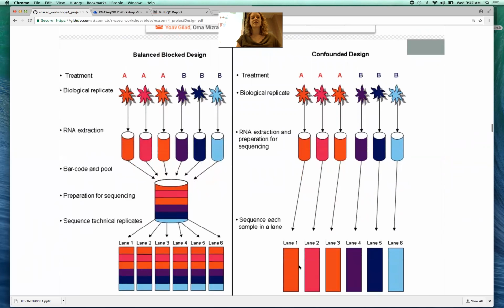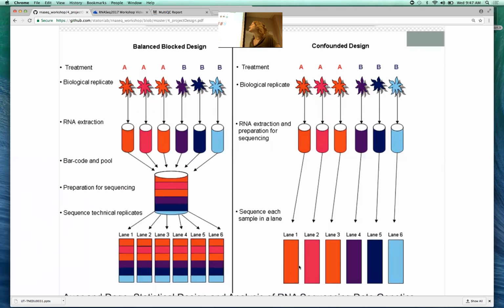And this is what is currently recommended. Instead of taking all 6 of your samples and running them on different lanes, or maybe you're even running this on one lane and this on one lane, that's creating false differences between how you're handling your control and treatment samples. A better way would be to take your 6 samples, when you have your libraries, split them evenly across your lanes. So sequence all of your samples at the same time. Don't ever treat your experiment and your control differently, except in your one experimental parameter. That's all you want to alter. Everything else should be the same.